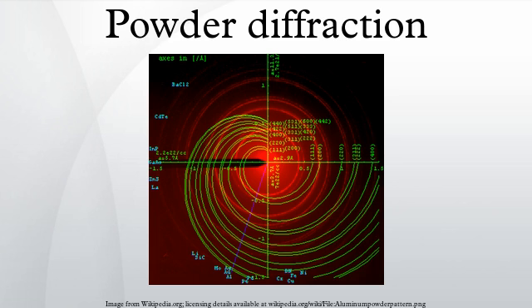Vanadium has a negligible absorption and coherent scattering cross-section for neutrons and is hence nearly invisible in a powder diffraction experiment. Vanadium does however have a considerable incoherent scattering cross-section, which may cause problems for more sensitive techniques such as neutron inelastic scattering. A later development in X-ray cameras is the Guinier camera.